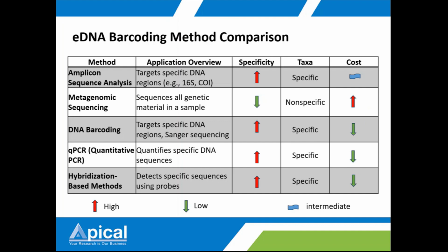However, because we have to sequence the samples, we have to sequence a huge amount, with deep coverage. So there's a cost for it. Normally, metagenomic sequencing prices won't come very cheap. We have to spend a lot just for sequencing, and the bioinformatic analysis also tends to be quite expensive.